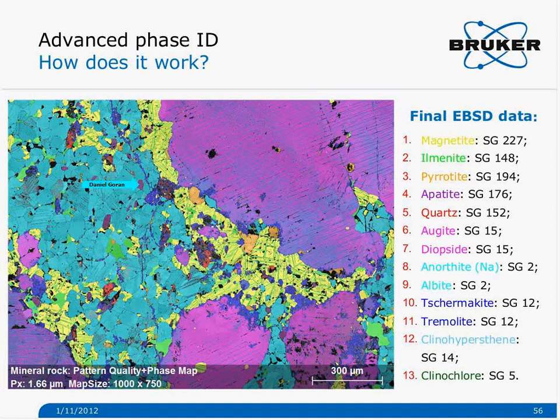So this is what the smart band detection is. It's doing a kind of averaging of pixels around the pixel we are looking at.